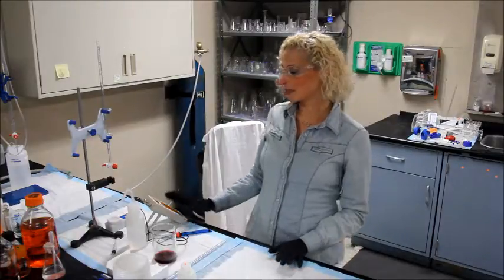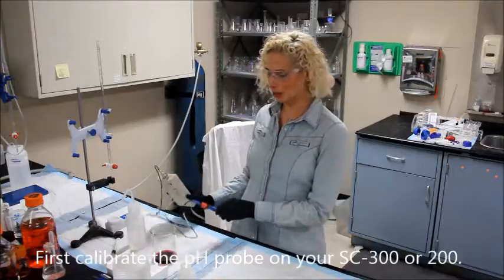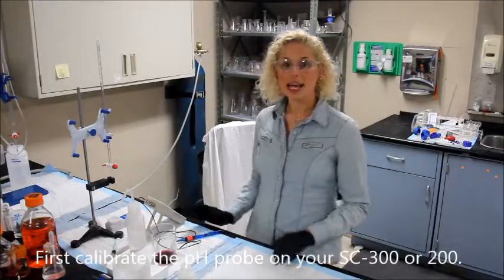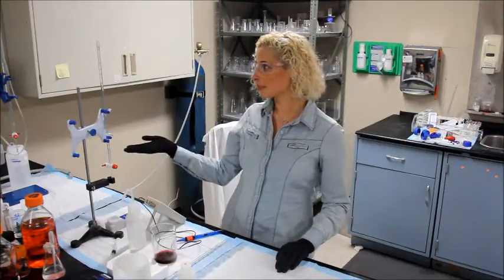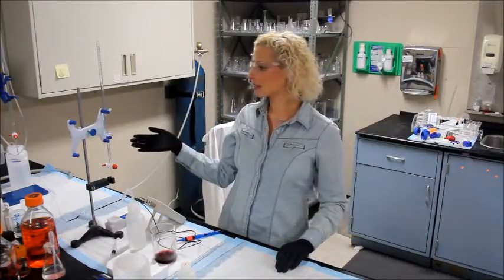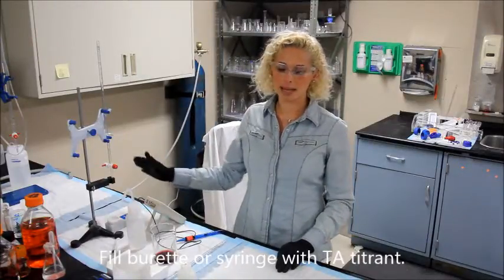To begin, you first want to calibrate your FC 300 or 200 and pH pro, which we already did. I'm also going to be showing you using our pro kit setup, so I went ahead and filled my 10 ml burette with TA titrant. We'll come back to that later.